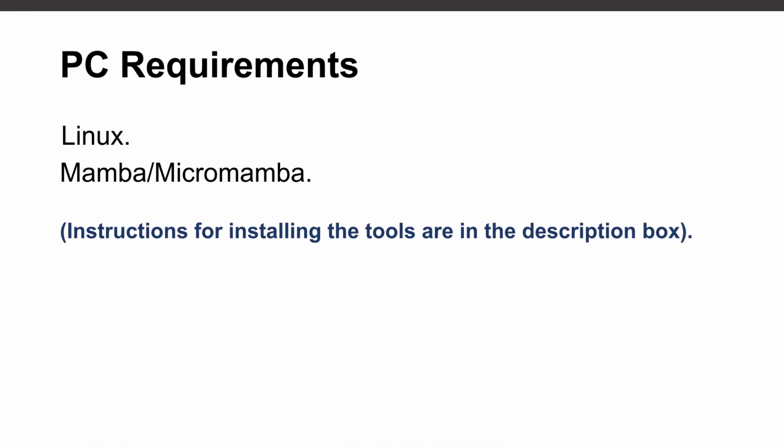Now for this tutorial, if you are going to follow it, you need to make sure your PC satisfies this requirement. You should have a Linux PC, and you should also have Mamba or Micromamba installed on that PC. I have tutorials that show how to set up Mamba and Micromamba, so check the description box and you'll find links to those tutorials. So let's get back to the terminal and start the exercise.